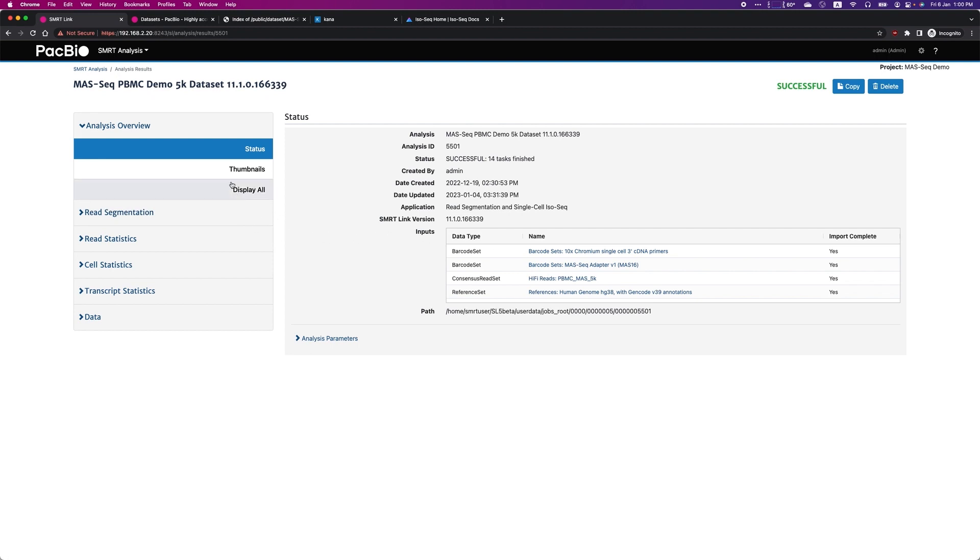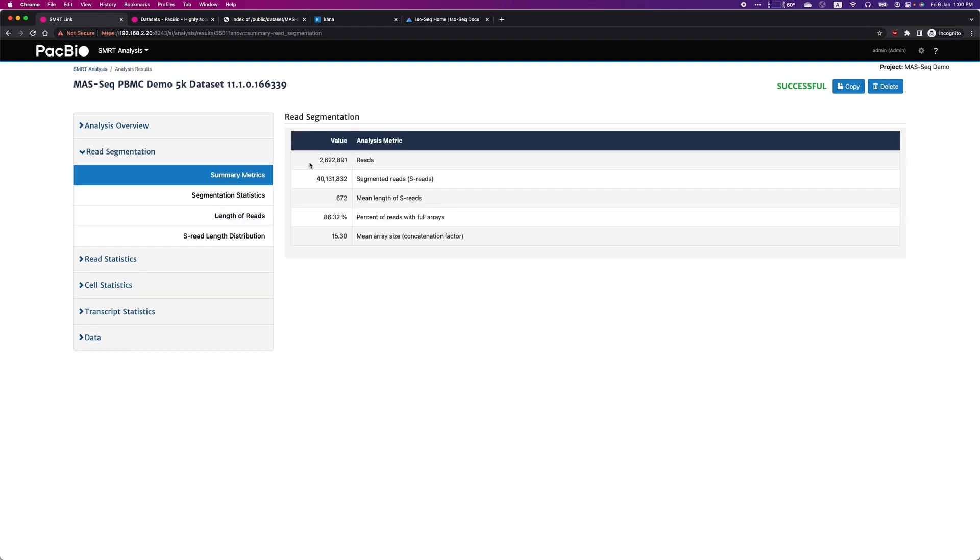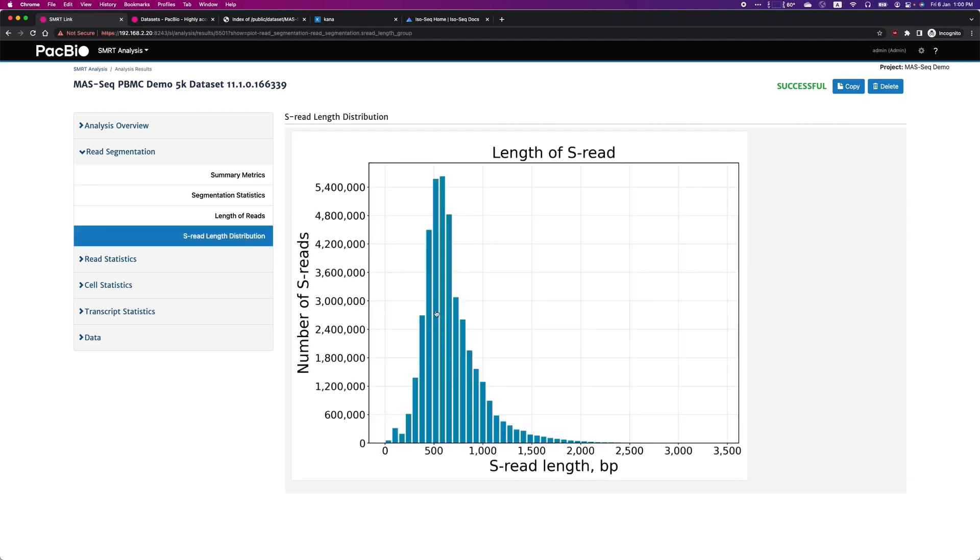Firstly, you can see from 2.6 million HiFi reads, we were able to obtain 40 million segmented reads after the concatenation. You can also see that the majority of HiFi reads contain the full 16-mer arrays. The standard read length of a 10x 3' library ranges from 300 base pair to 2,500 base pair.